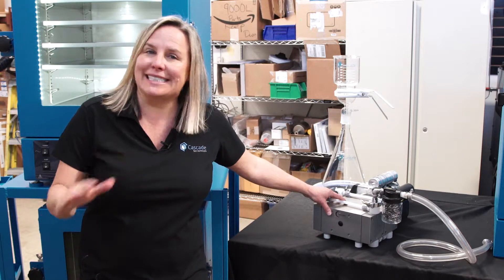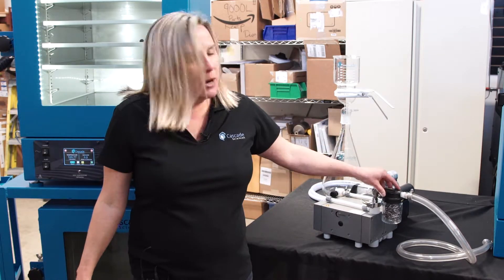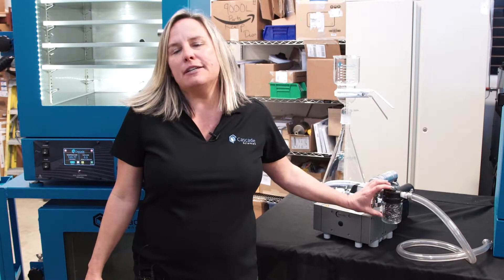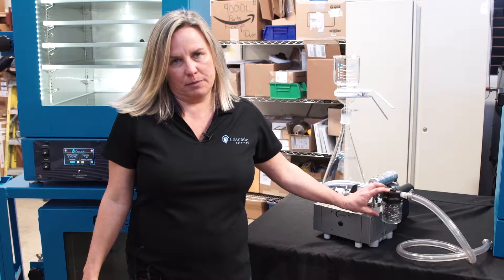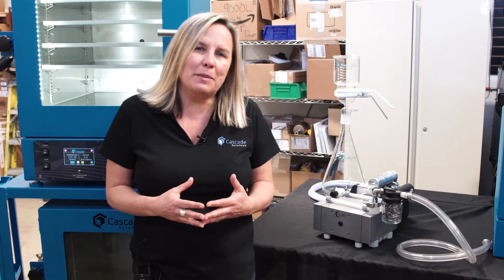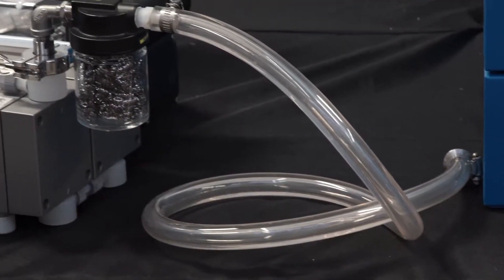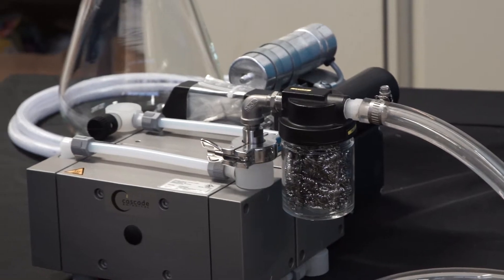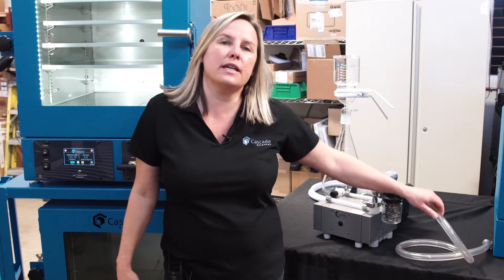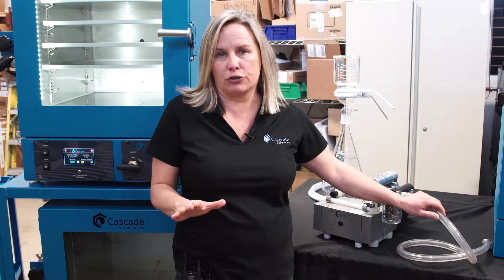The Cascade version is the exact same Welsh 2052, but we include a few extras. We put an inlet filter on this pump. This is a best practice idea — in case the pump is going to be ingesting a lot of water or sticky material, this inlet filter trap will help mitigate that so that the pump will perform better longer. We also include four feet of 3/8" diameter vacuum tubing as well, no extra charge.